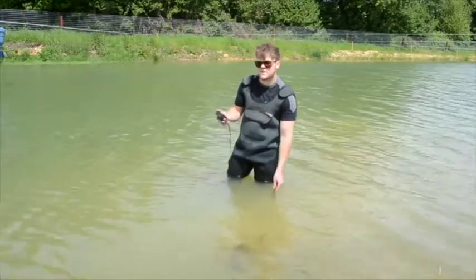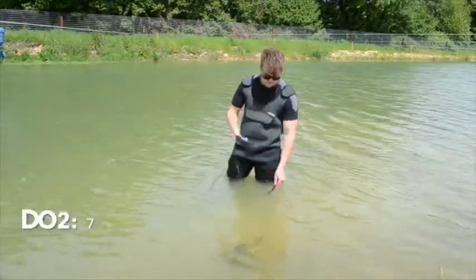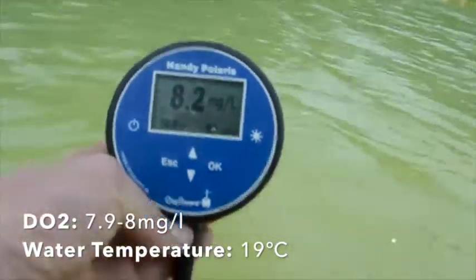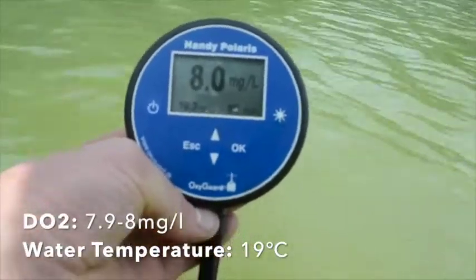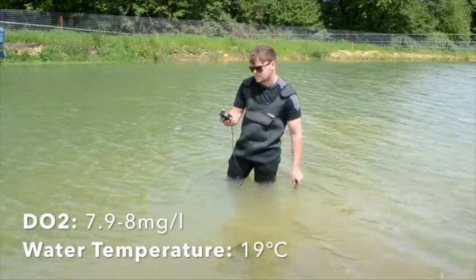That's the only thing that will mess it up, so leave that alone. Just keep the probe moving and take your oxygen reading. It's about 7.98 milligrams per litre, which is 86 percent saturation, but we don't use saturation - milligrams per litre gives a much more comparable reading for what we need to know. A really good piece of kit.